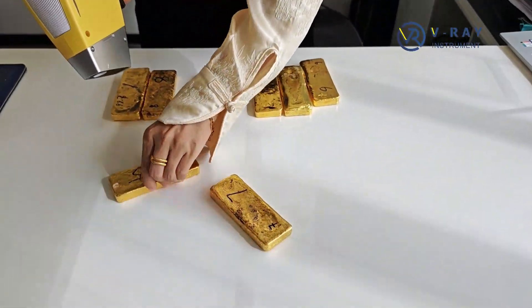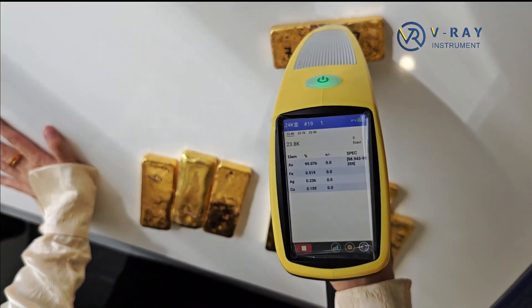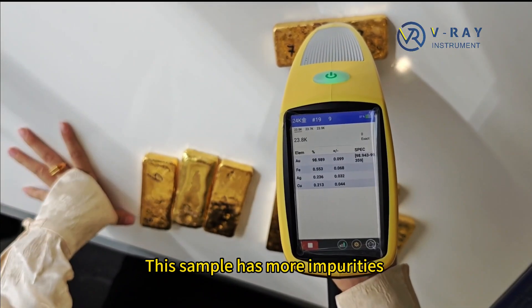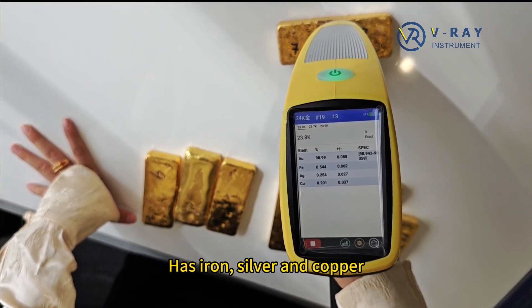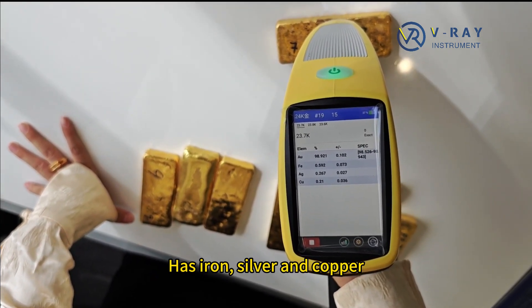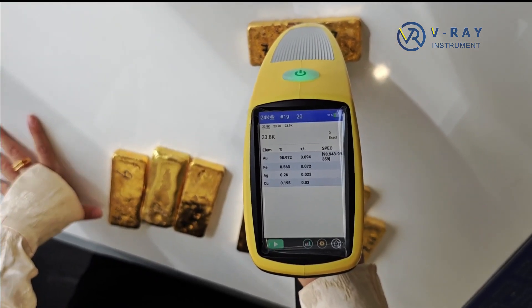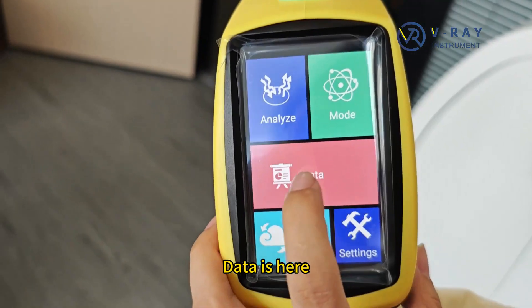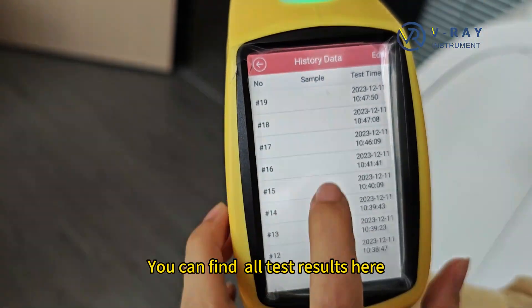One more sample. This sample has more impurities. It has silver and copper. The data is here. You can find all test results here.